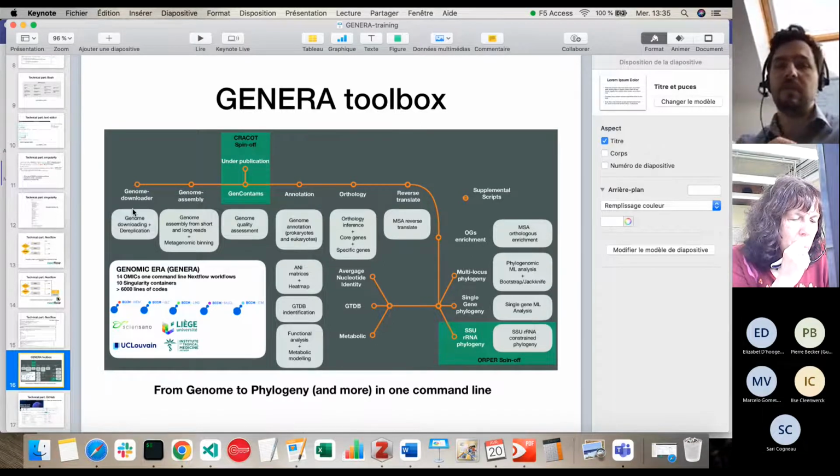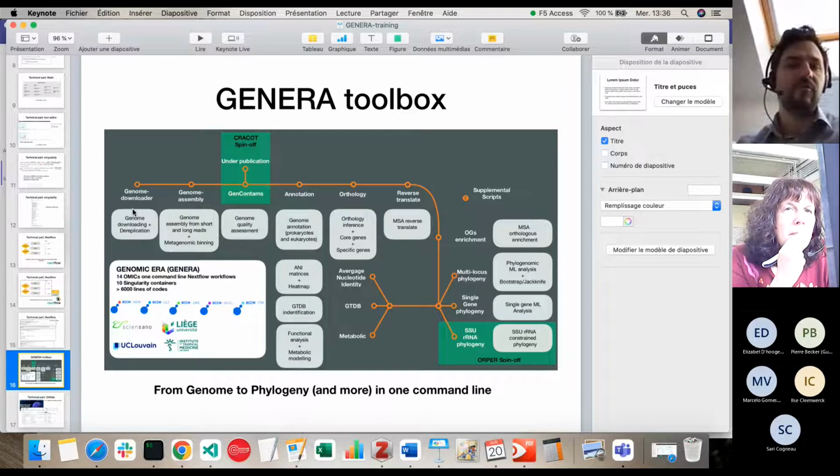But I think it's actually how all bioinformaticians should work also. Having workflows installed for an analysis and developing your study with workflows is really a good way to think, because it saves your time. If you want to do the same analysis later, you don't have to rerun anything else. You just have your workflow ready. And of course, for the review, it's really easier to have that.